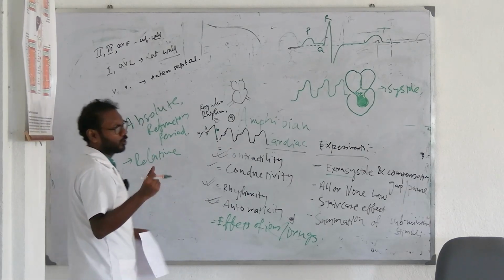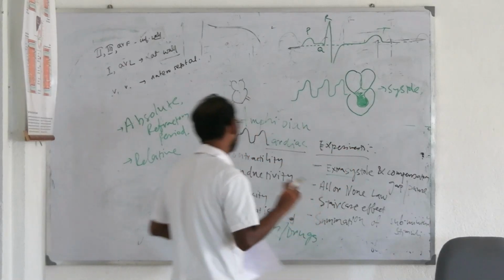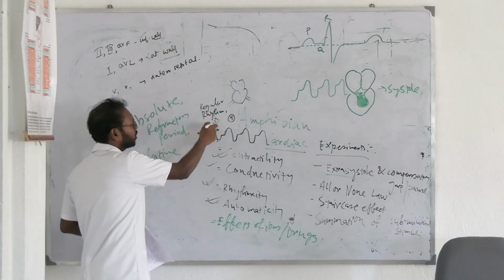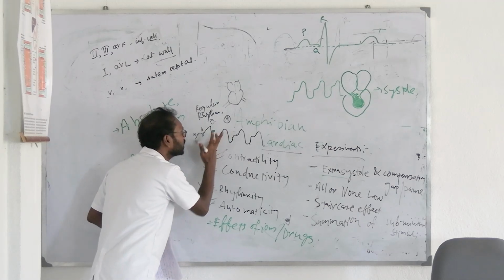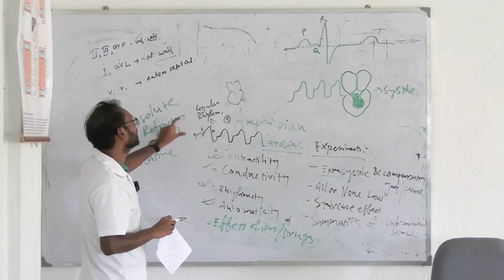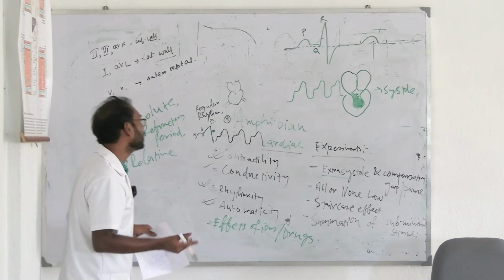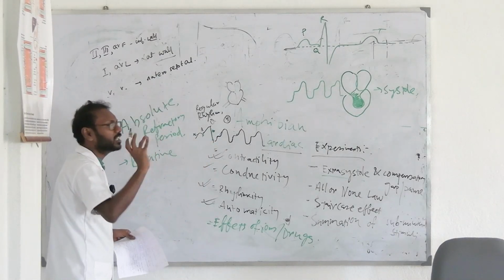Or rather, the time between the atrial contraction and ventricular contraction, to the next wave. So before this next wave starts, the space in the middle of this contraction, we call it the refractory period, or a period between a muscle contraction and a muscle relaxation, to put it simply, okay? Relaxation starts from here, so the period in between we call the refractory period.